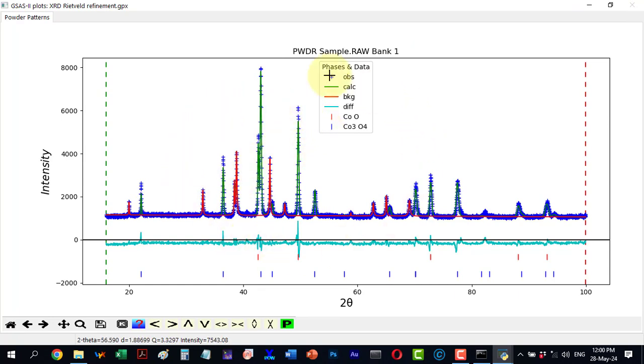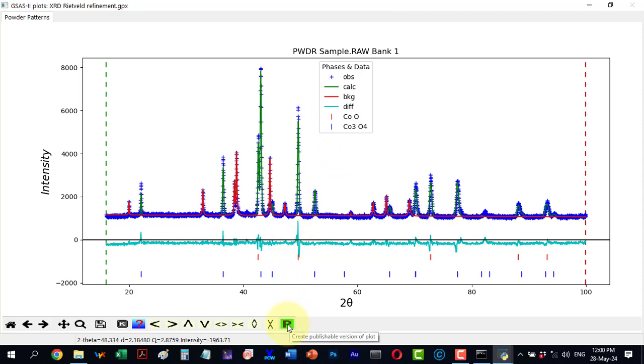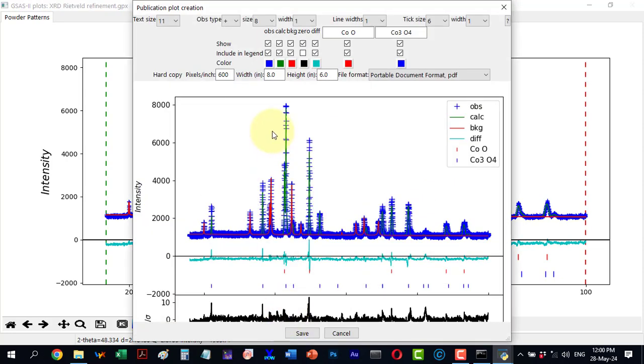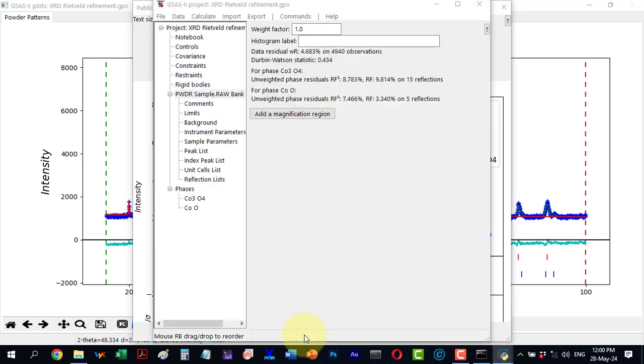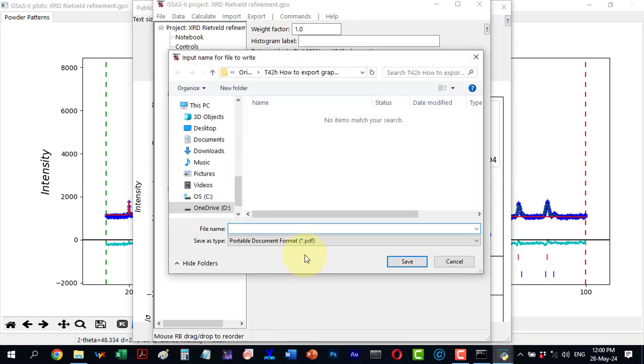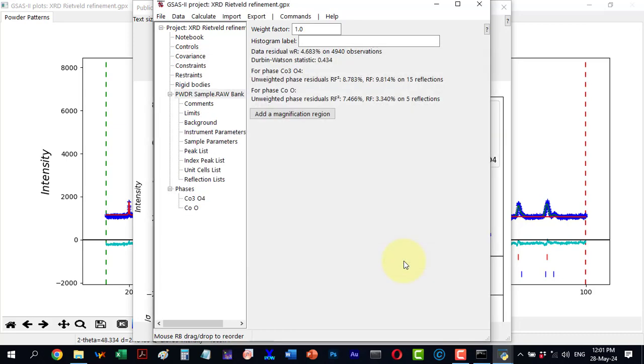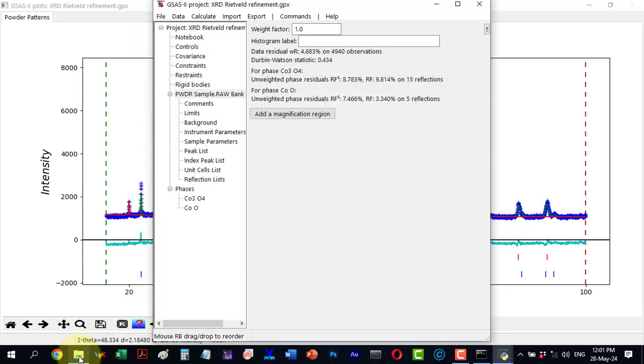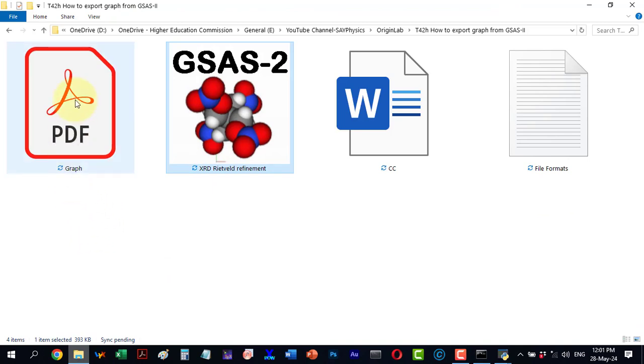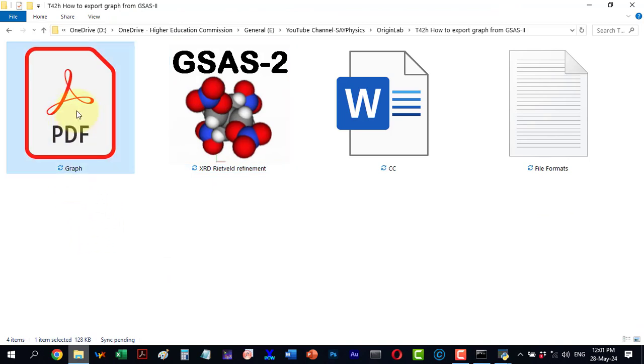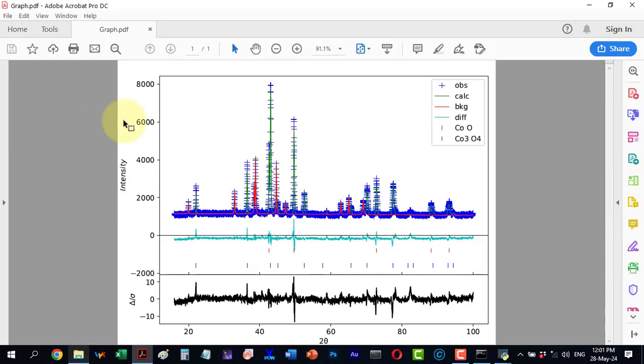We want to export this file. We can export it directly without any customization by clicking the P symbol, which creates a publishable version of the plot. I click the symbol and a menu appears. Since I am not customizing anything, I will click save and it will ask for the location where I want to save this file. I will give it a name and export it as a PDF. By default we save it, and now the file is saved. Here is the file, let me open it, and here it is.